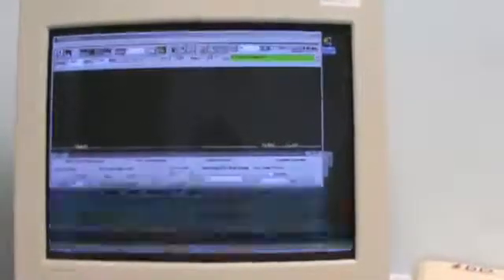Nothing on the special preset. Common control. Typically the coarse gain for STD will be 64. The fine gain will be anything between 1.2 and 1.5. But these will automatically be set when you do auto calibration once the STD is cold. You can now click on enable to run the bias voltage up to 180.